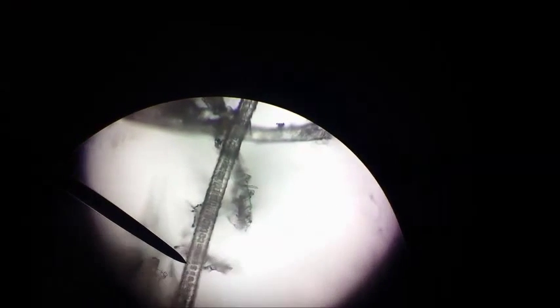Possibly water mold. I saw something earlier, and some of this stuff looks kind of green, so might can make a case. And just remember, I'm not a microscopic expert. I'm just an amateur piecing some clues together. So, pet dander and dust. I definitely have an agreeable decision on that in my mind. Possible water mold, possible green plant matter, maybe. Maybe not likely.